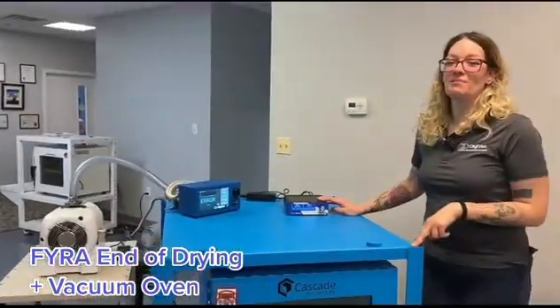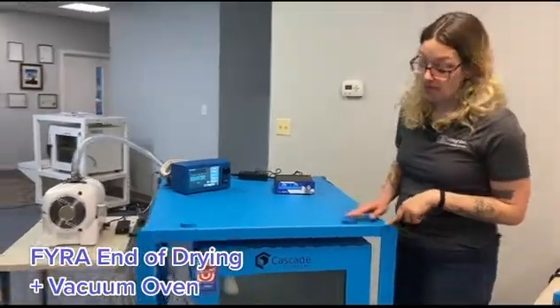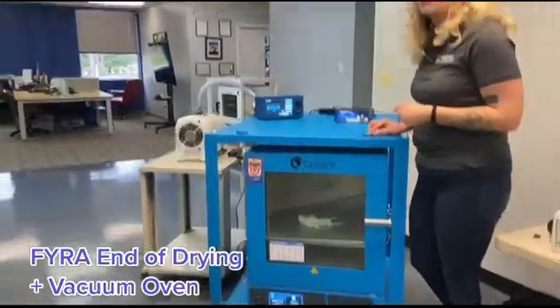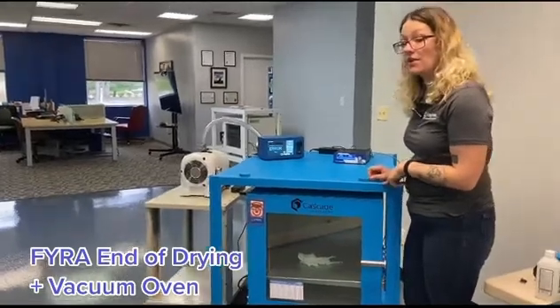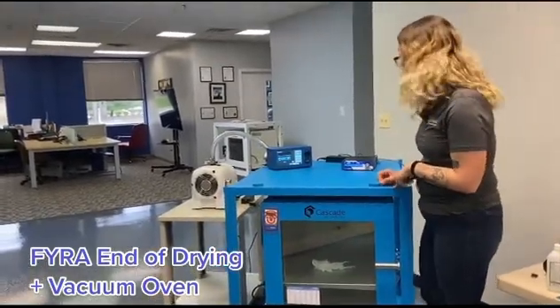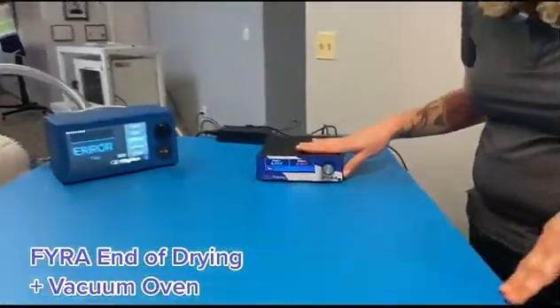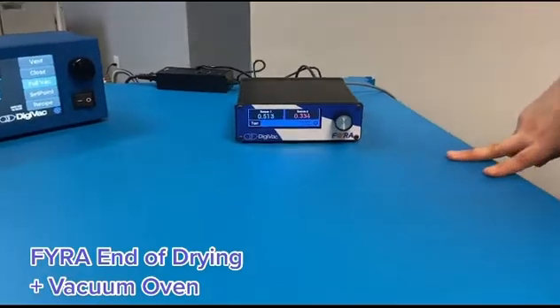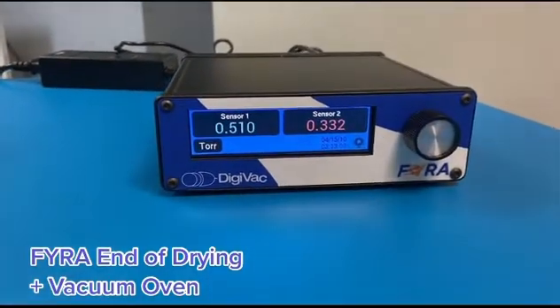The end-of-drying process requires the removal of all water and solvent from the cannabis isolate inside the oven. We do that by applying heat and vacuum to the system, but outgassing materials are always a concern. An easy way to tell if there's still excess moisture in your vacuum oven is to see what the two sensors connected to the FIRA are doing. When they're reading very far apart, there's more moisture in your vacuum system. You can see here the numbers are relatively close, so the system is dry.